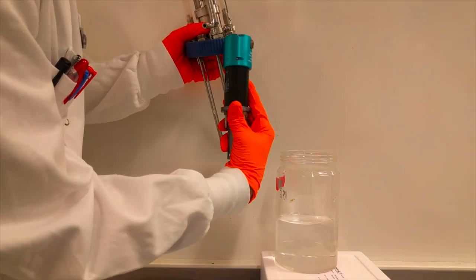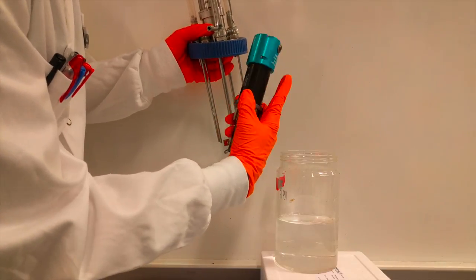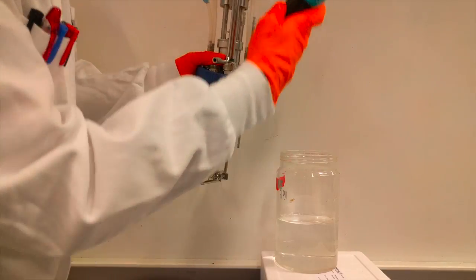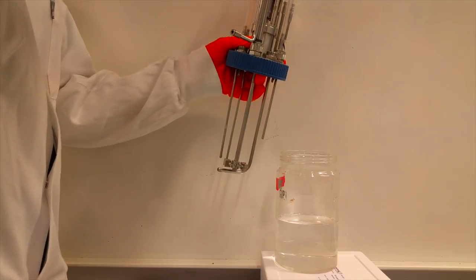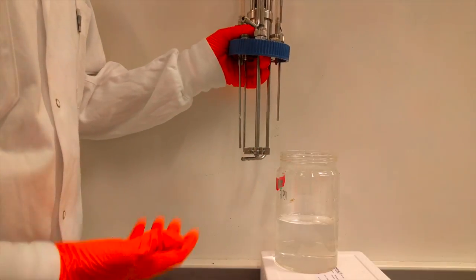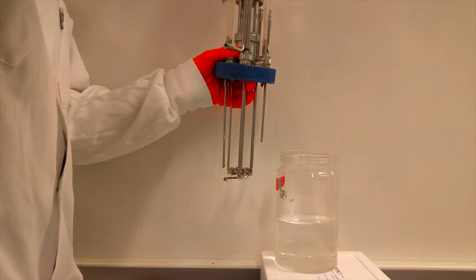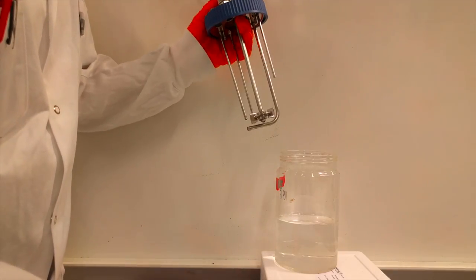That's going to be stirred via a motor, which is going to spin this top piece, spinning the impeller. The motor is not so complicated looking - it just looks like this. We're going to plug a cord in here at the top. A computer will control the speed.